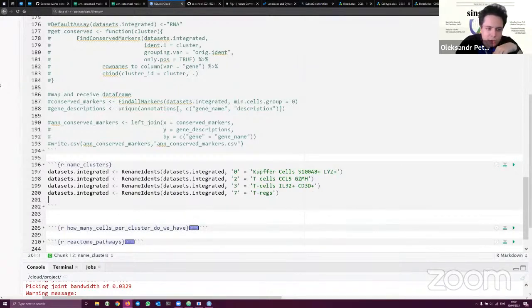So as Mohabat mentioned, in the liver, these cells are written as C10, C15, C1, which means that in the specific data set they use for the liver tissue, they just marked them as T cell cluster 10, cluster 15, and cluster 1. And people often do this, for example, if the cells are newly described and there's not that much information regarding this marker combination.